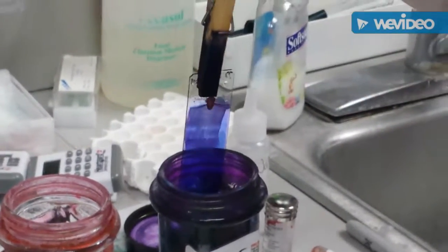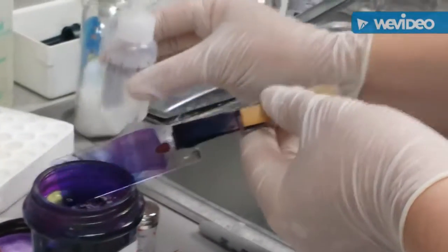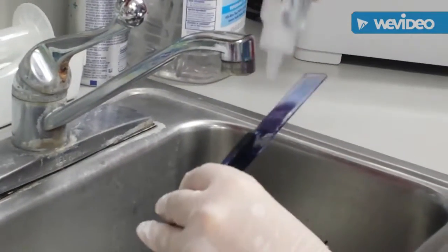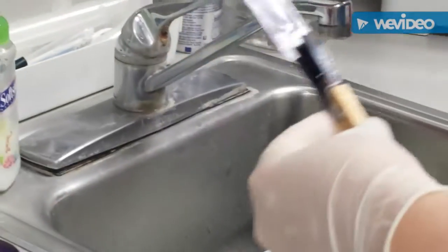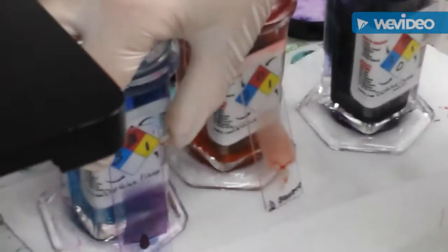Okay, then we want to make sure that we have, if we were using a frosted slide, the frosted side down, that would show our butt. However, we have labeled it with our patient's name. So we want to make sure that's pointing down, and we're going to go ahead and rinse off our slide. Then we're going to go ahead and gently remove it and place it butt down so that it can dry.